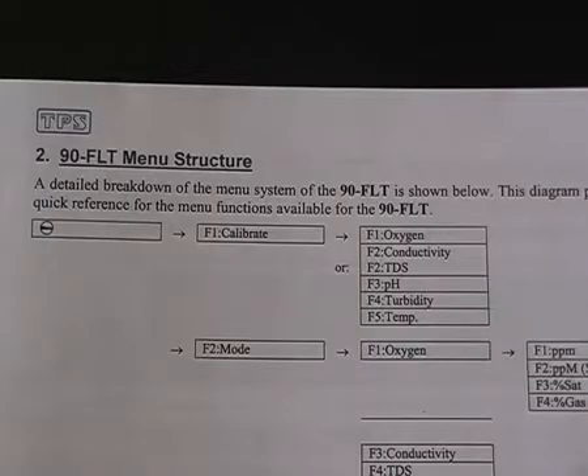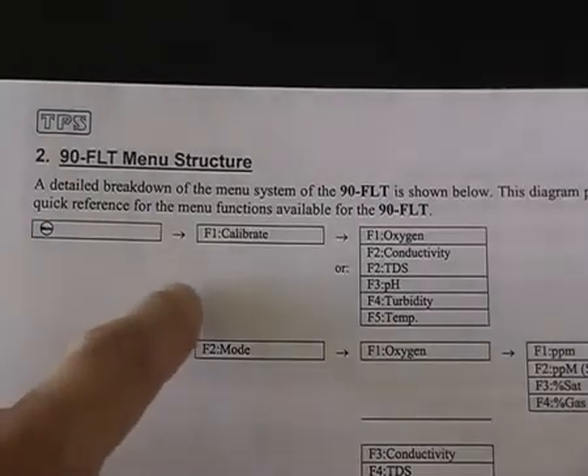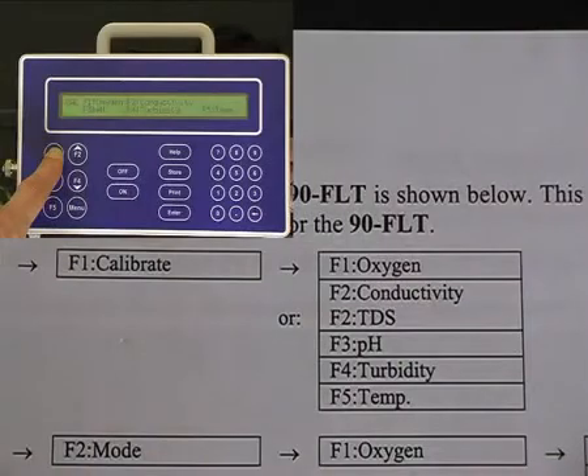To calibrate the 90FLT, first press menu, and then press F1 for calibrate. After F1, there are five sensors to calibrate.